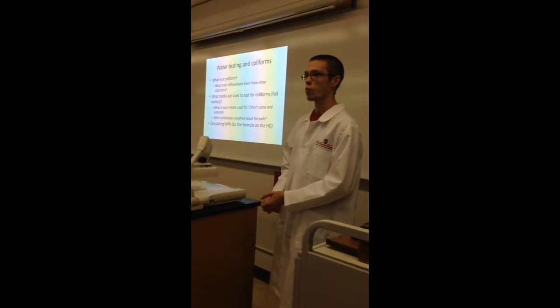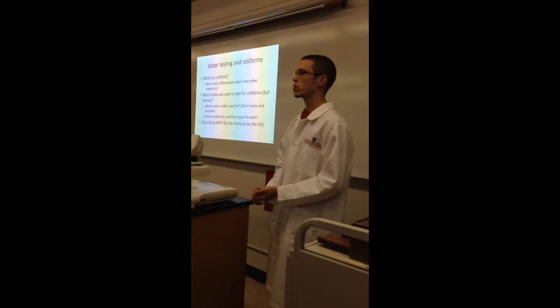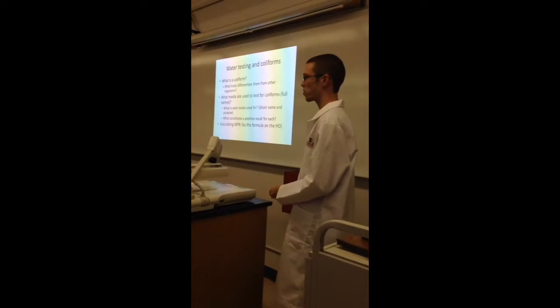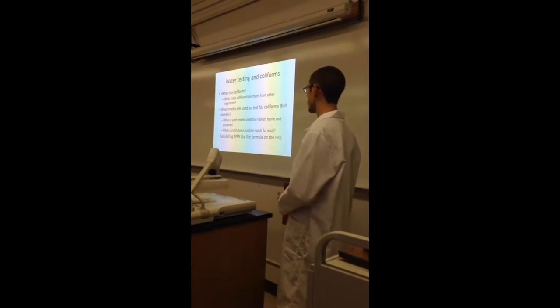For this, you want to know the full names, as well as the short names. So you know it was presumptive, confirmed, and complete. But what are the actual media that are used for those tests? And what's the purpose of each media? They each tell you something different. And what constitutes positive results?